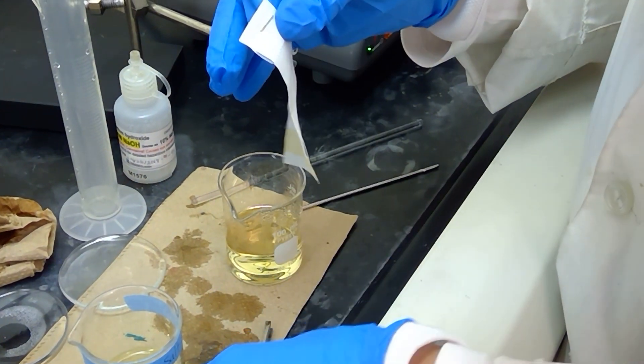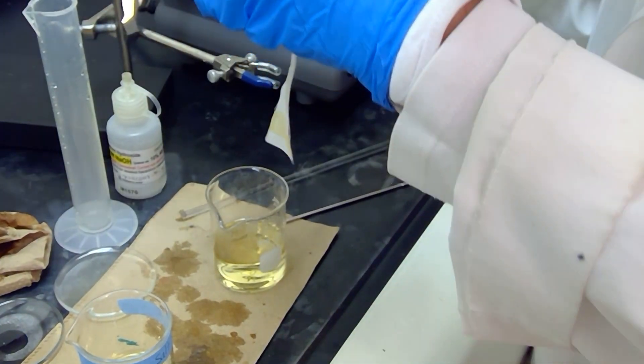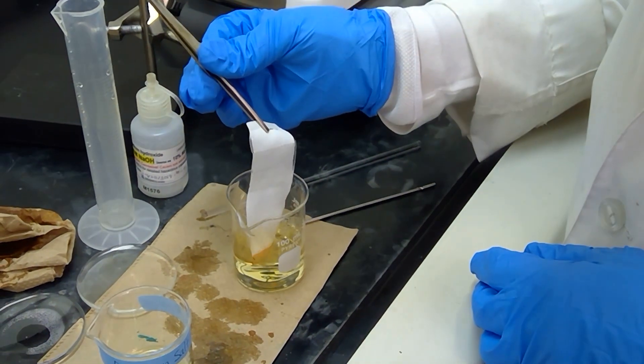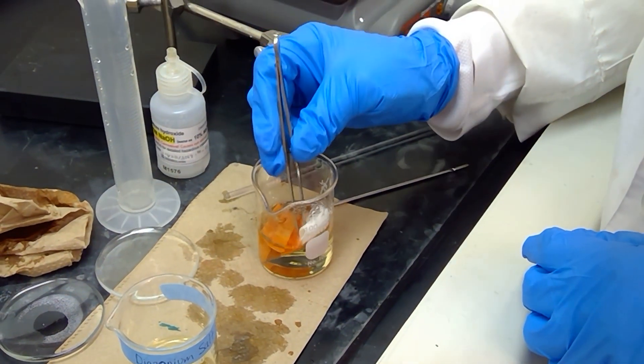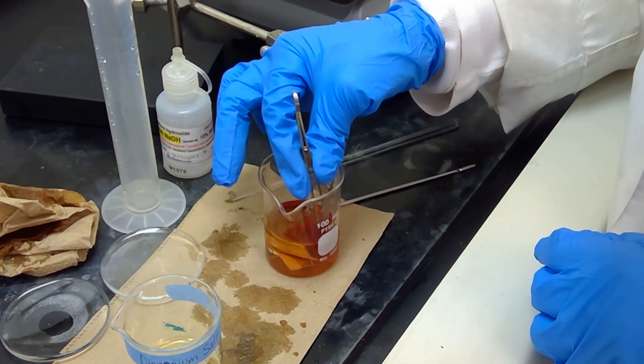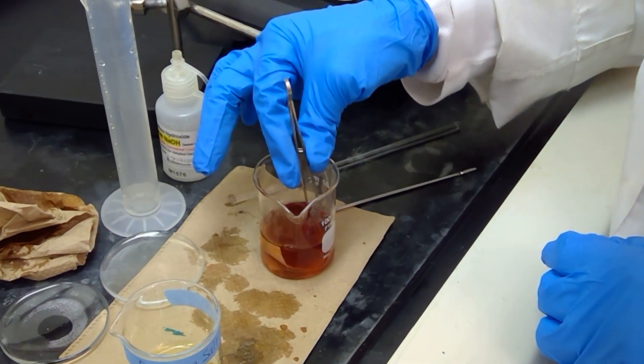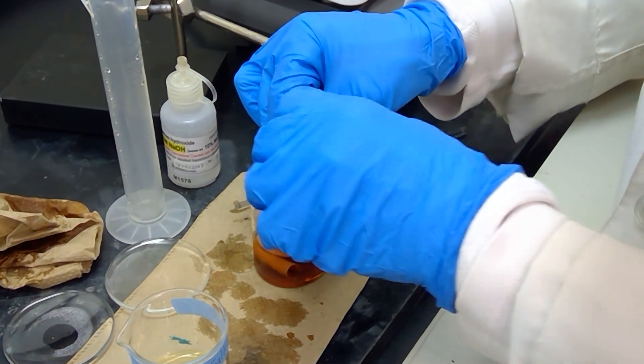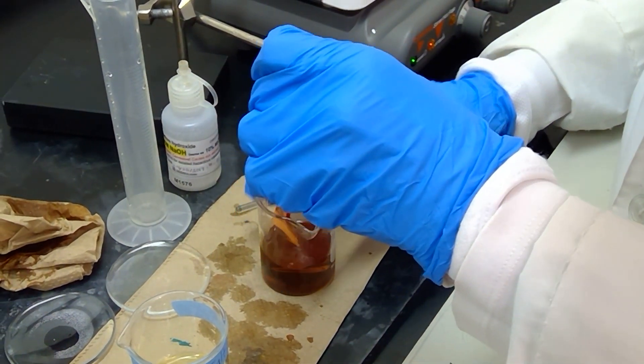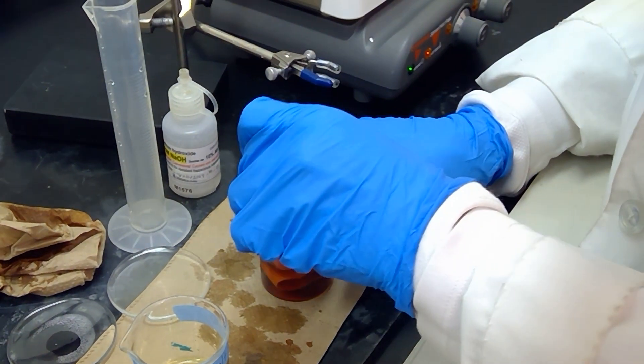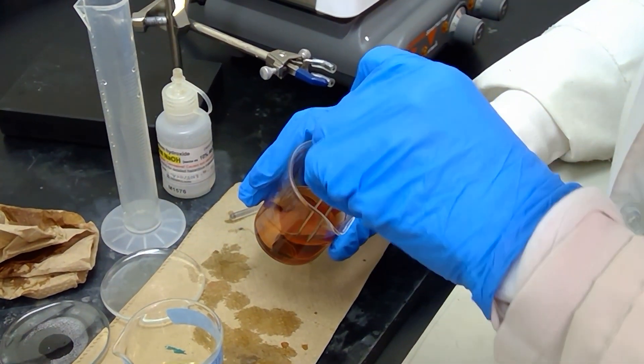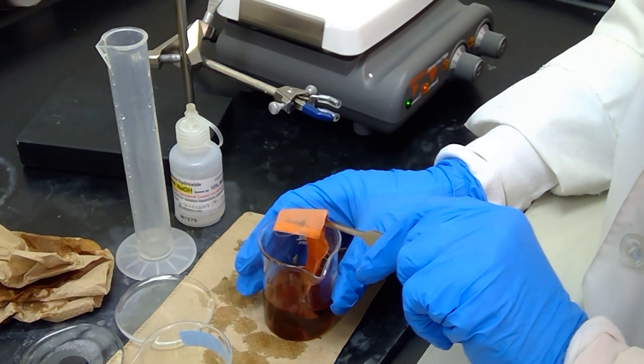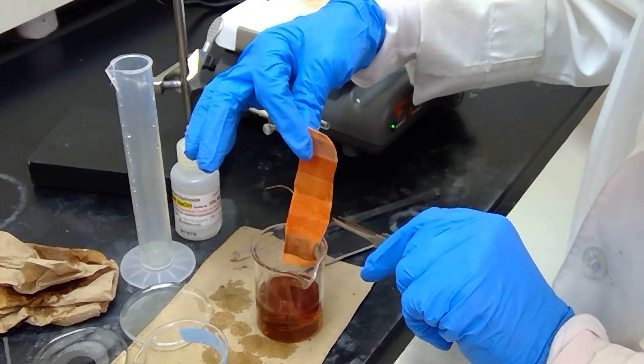I am now placing the fabric strip into the solution of 2-naphthol, and we should see American Flag Red result in just a moment. Alright, so if you notice here, the colors that I'm getting are a little bit orange-ish, and not necessarily extremely red. But the reason for that is, the fabrics here are not the same type that the first American Flag was made with.